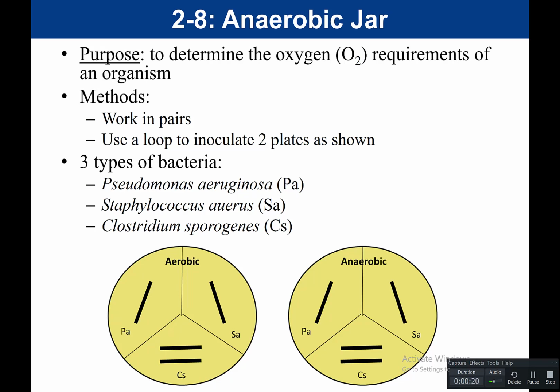Meaning, do they grow when only oxygen is present? Do they grow when only oxygen is absent, meaning anaerobic? Or do they grow both aerobically and anaerobically, meaning they can grow with or without oxygen?